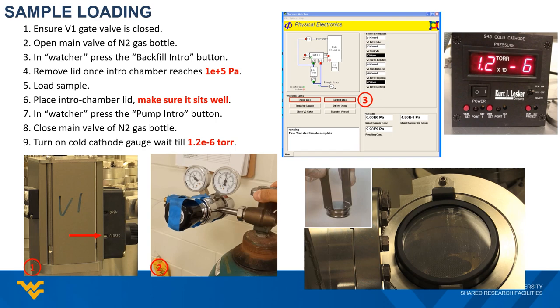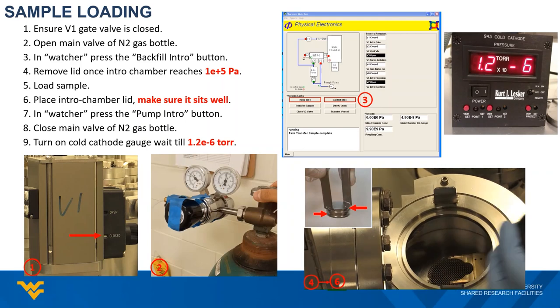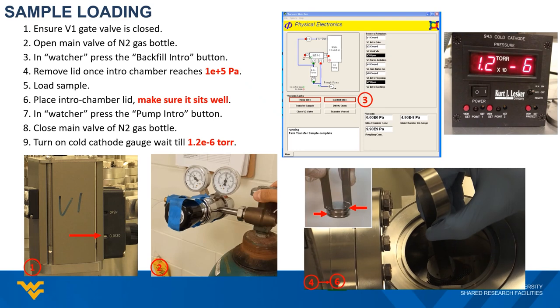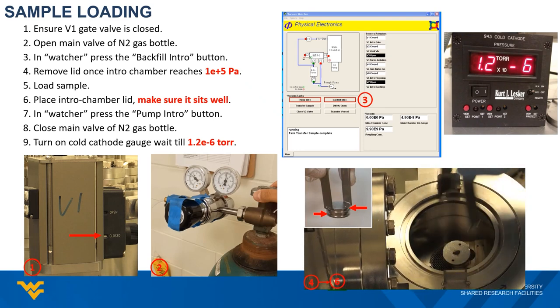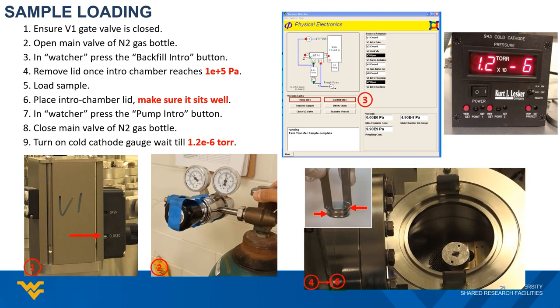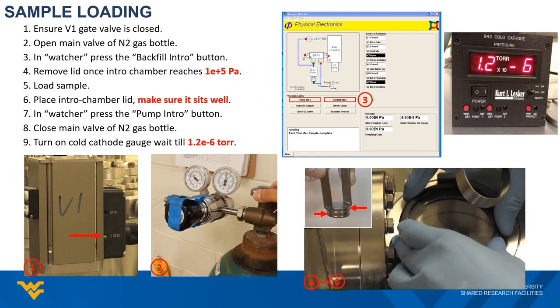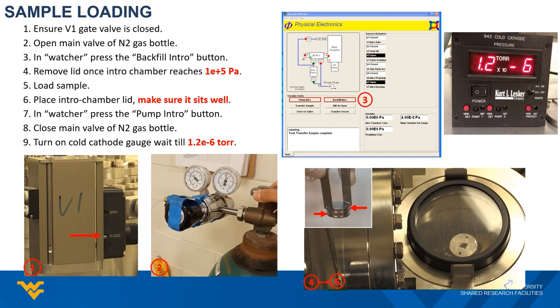Once the pressure reaches atmospheric level, lift the intro chamber lid and grab your sample with the special tong as indicated in the photo, then slide your sample onto the sample loading fork. Push the end of the sample to make sure it reaches the end of the fork. After that, put the lid back on.